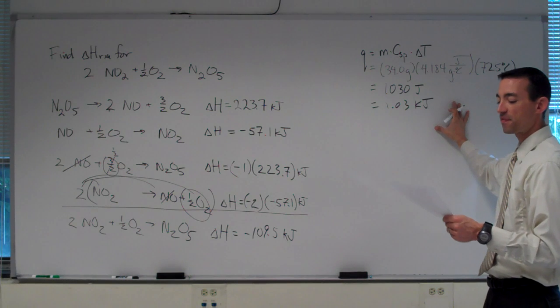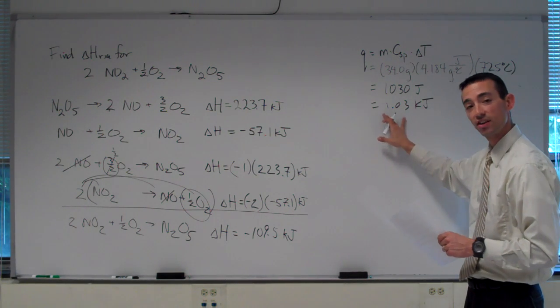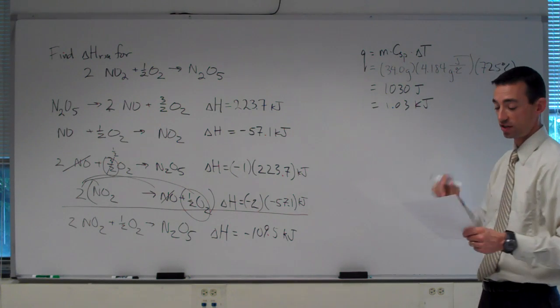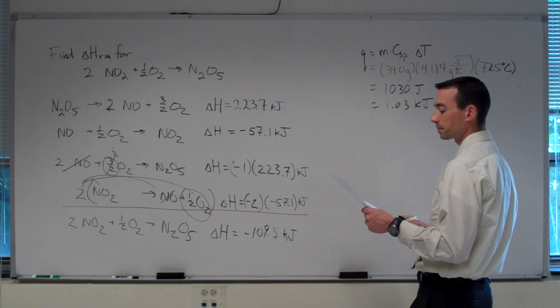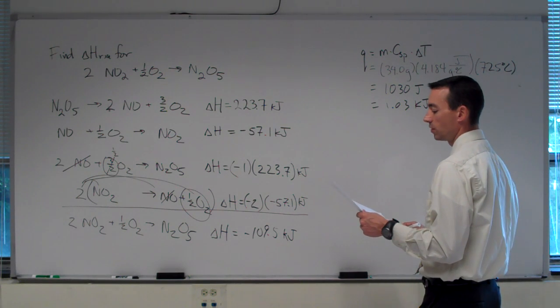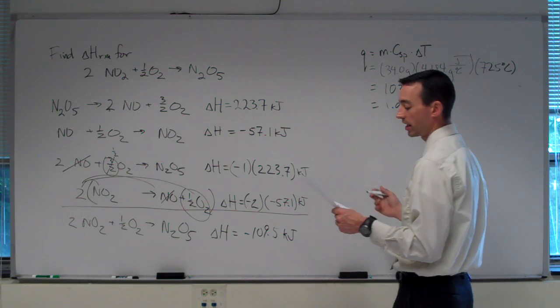This heat then came from a reaction, so that's why we would put a negative sign on it for the Q of the reaction in today's lab. Okay? Question 2 in the pre-lab is related to calculating the molar quantity of heat on a mole scale.